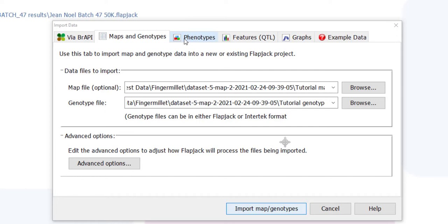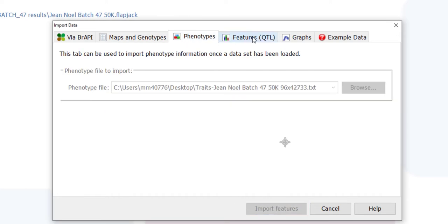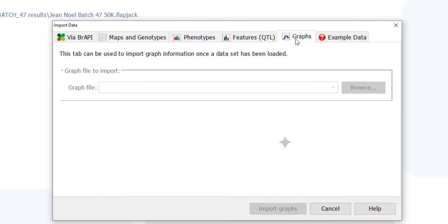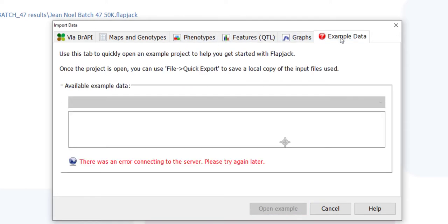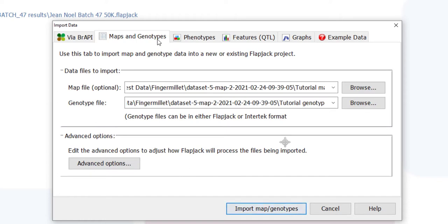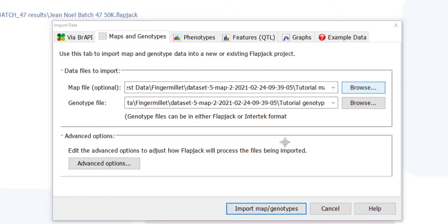As mentioned previously, a map and genotype file are all that's required to create a Flapjack project. Browse and select your desired files then click the import button.